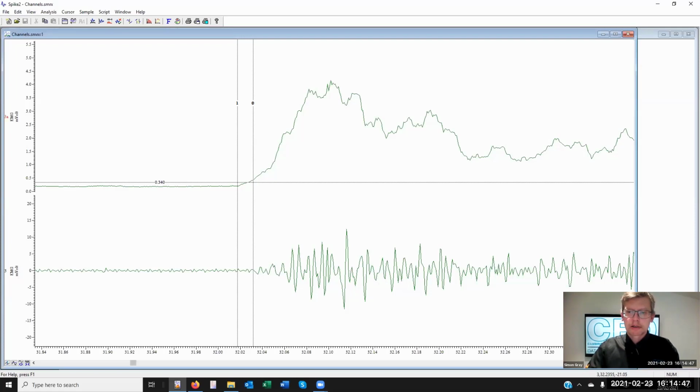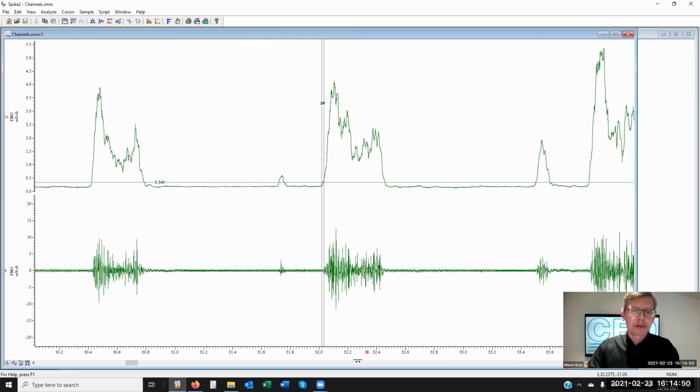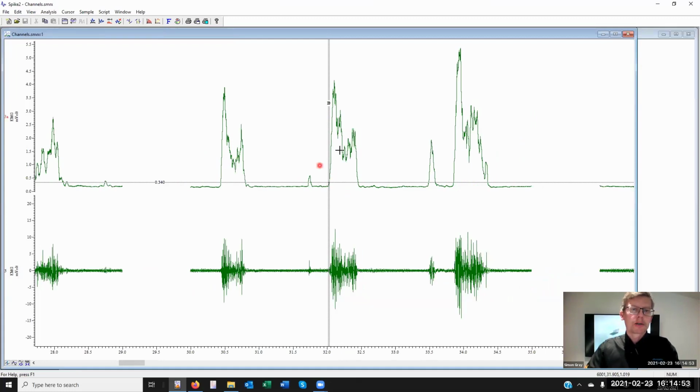Now, the same techniques as used before, measure to channel or measure to XY view. We could ask for another cursor to step forward through this burst, again, possibly looking to avoid data that drops underneath the threshold for a very short time, and look for where the waveform returns to threshold. Another way, of course, is to throw cursor 2 way to the right, if we can, and then ask it to walk to the left.